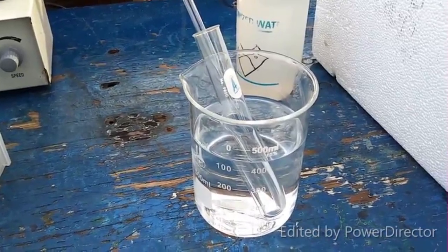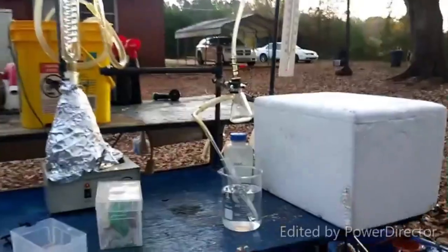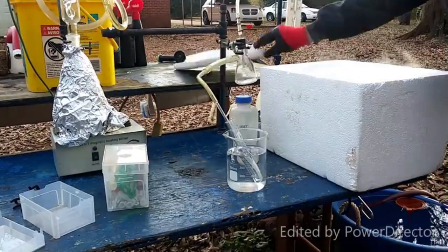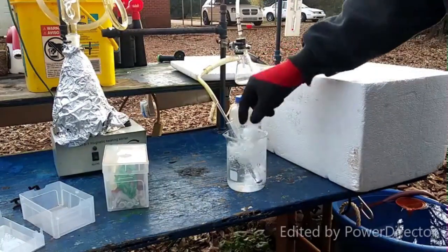The beaker is full of acetone, and that ammonia generator is really going now. I'm going to go ahead and put some dry ice in and let's get this party started.